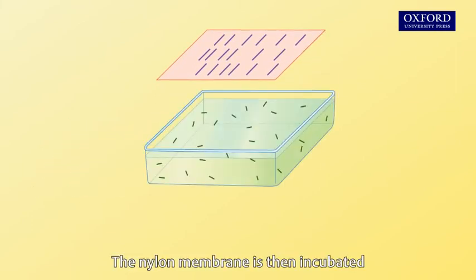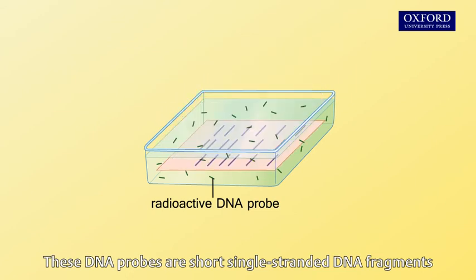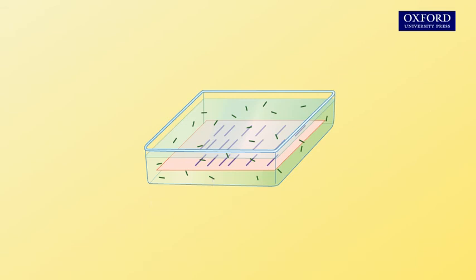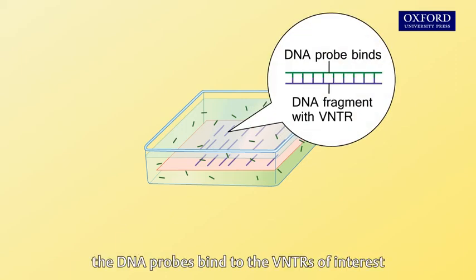The nylon membrane is then incubated with radioactive DNA probes. These DNA probes are short single-stranded DNA fragments that are complementary to the VNTRs of interest. During incubation, the DNA probes bind to the VNTRs of interest.